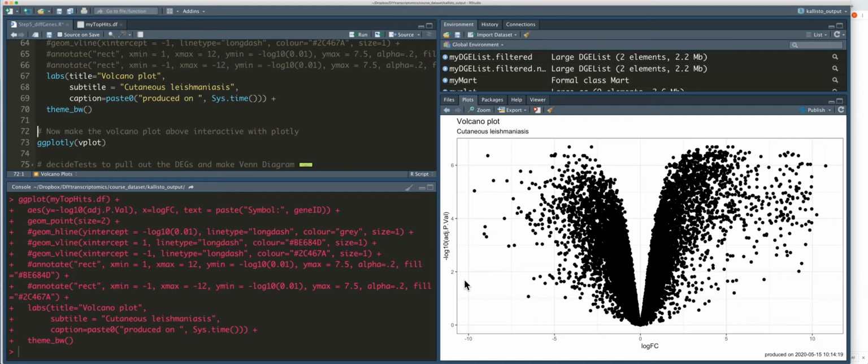They're much further to the left. These genes here to the right are much higher in disease compared to healthy. All right. So I also told you we transformed this adjusted p-value or FDR to make it the inverse log 10. That means that genes that had very, very low adjusted p-values now appear very high up.